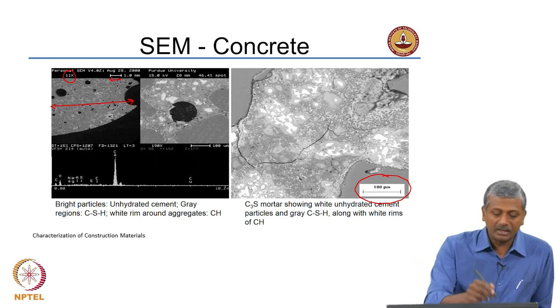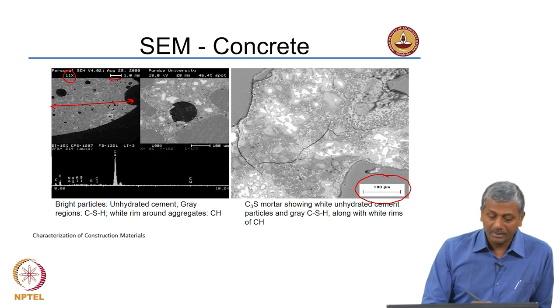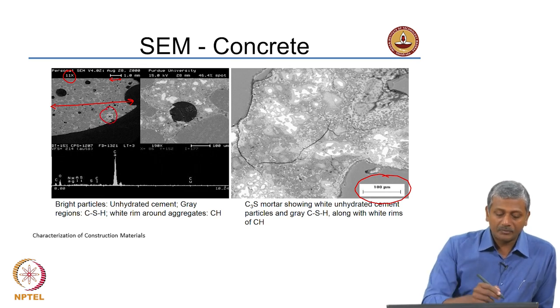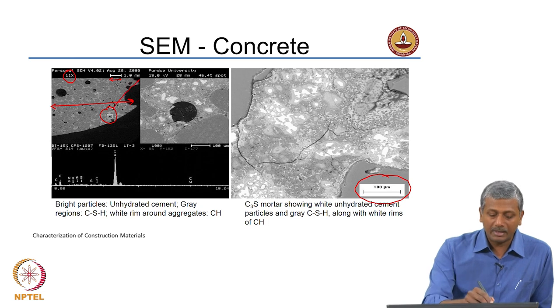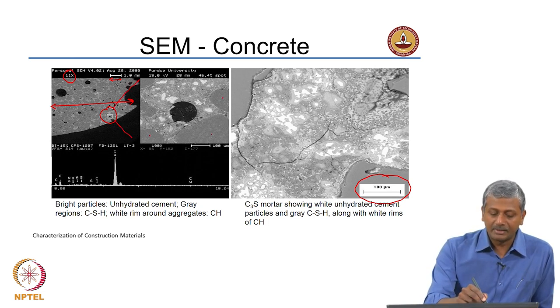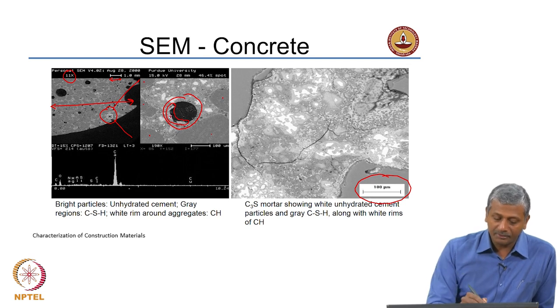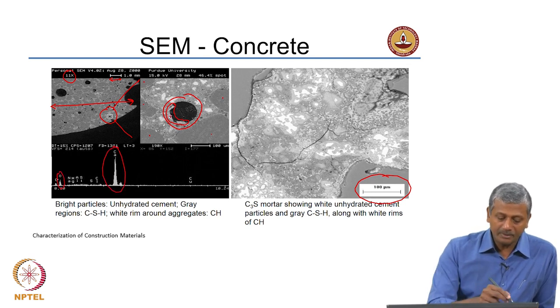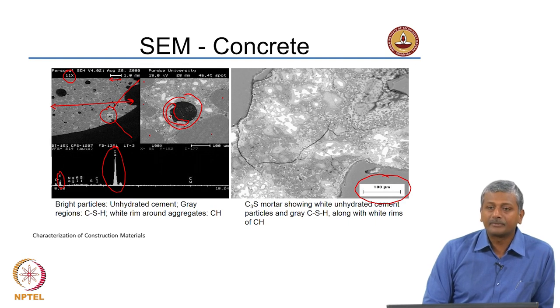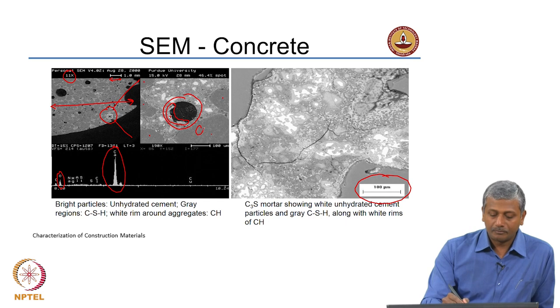Here you see an example on the left side of a cement mortar, and a smaller area in the cement mortar is zoomed and magnified on the right side. You can see siliceous aggregates with paste in between. There is also an air void, and what you see is a deposit lining the air void. A spot analysis of the deposit shows calcium and oxygen peaks — that is basically calcium hydroxide.